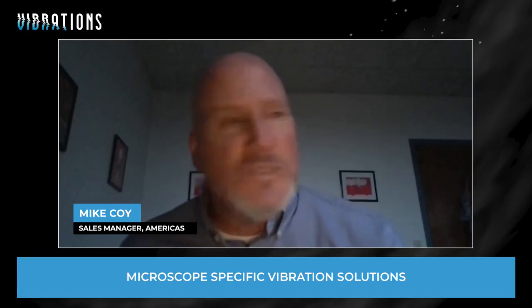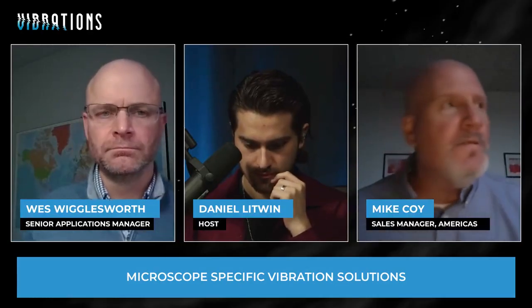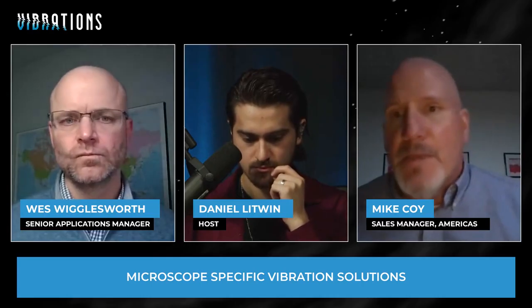Yeah, I agree 100% with Wes. If you wait until your instrument's delivered, you're in big trouble already, right? And if it's a new facility being built, we encourage them to talk to our experts here about small choices that could be made early on that would make a big difference down the road. And if it's an existing facility, a lot of our current customers reach out to us to help them make decisions, maybe not on which microscope to buy. We try to stay out of that, obviously, but where do they want to install it?